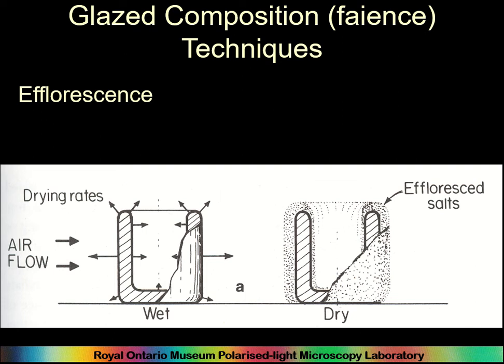They stay together long enough for the firing, and in the firing they fuse together sufficiently to stay together. In some cases, glass had been added to the quartz, but quite often it's actually just the glaze material on the outside which fuse everything together.